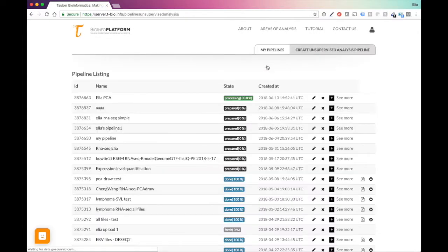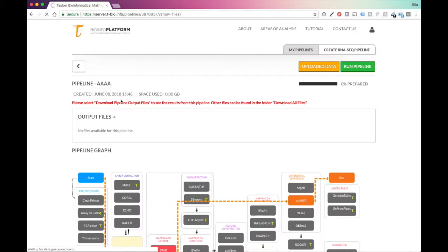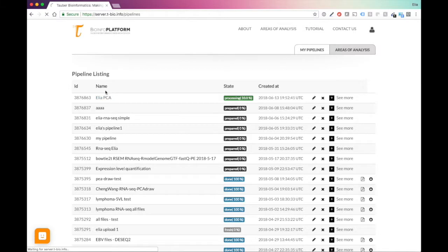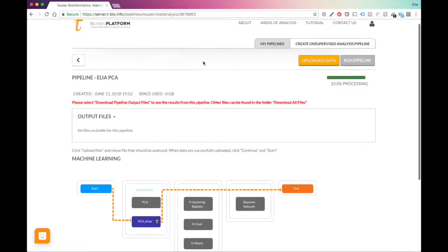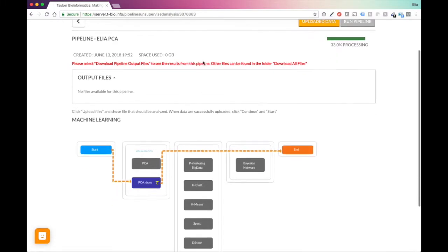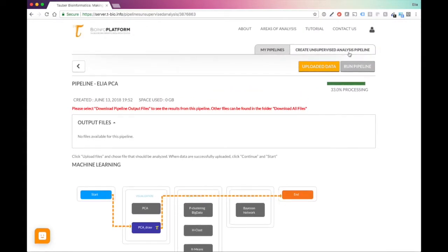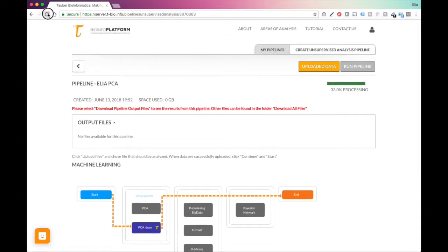Let's go under my pipelines. You can see that this is processing. Remember that if you have something like this that says prepared, that means that you have not started the pipeline. You did not press on run pipeline. I didn't do it because I was demonstrating it. So I didn't really want to waste the resources and run the pipeline. But sometimes you will have this option to run pipeline here. You can see that it's already processing. That means it's working. So how do we get the results? Let's give it another minute.